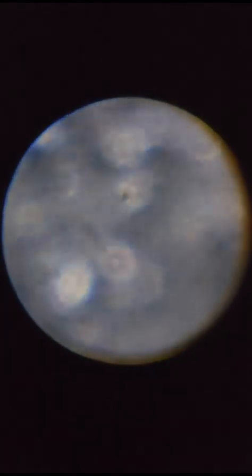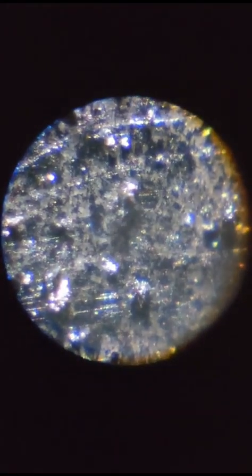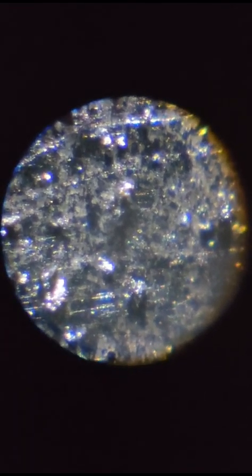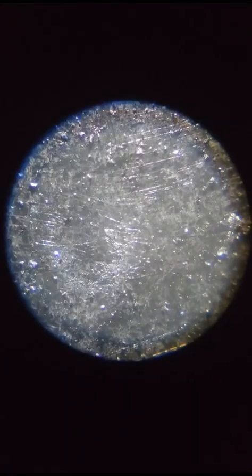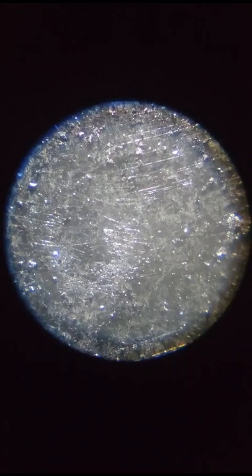Let me change a little bit of the frequency. How does this look? And I zoom it in. This is a pencil thing. What's this? Now let's zoom back to 50 and zoom out and see what's outside. Okay, now we have reached 50 times.